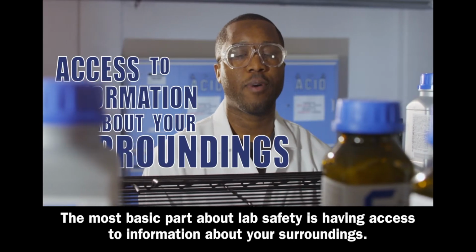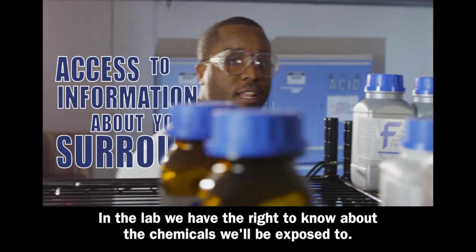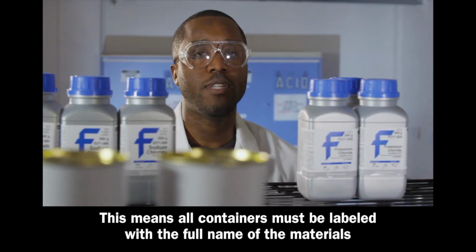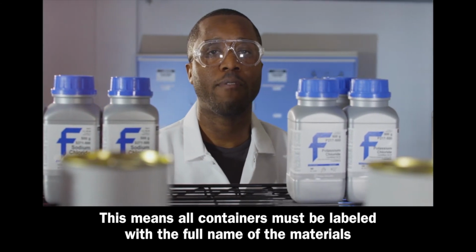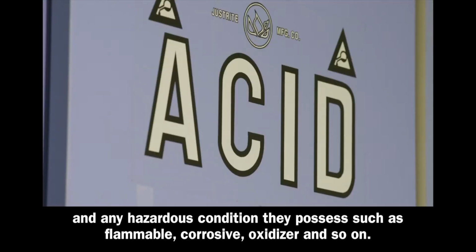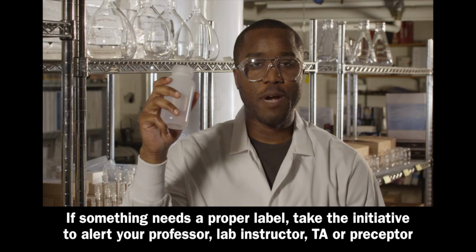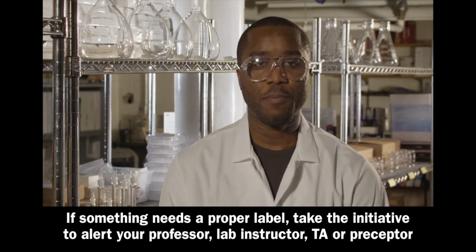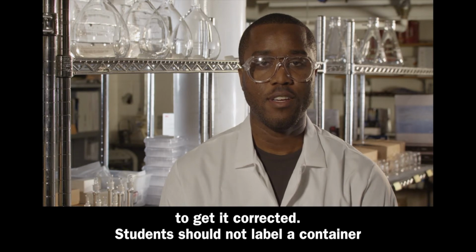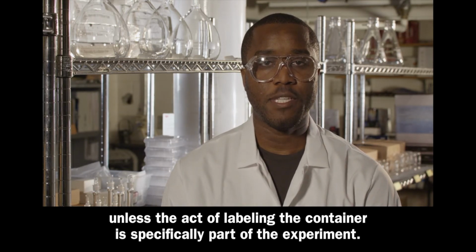The most basic part about lab safety is having access to information about your surroundings. In the lab, we have the right to know about the chemicals we will be exposed to. This means all containers must be labeled with the full name of their materials and any hazard condition they possess, such as flammable, corrosive, oxidizer, and so on. If something needs a proper label, take the initiative to alert your professor, lab instructor, TA, or preceptor to get it corrected.